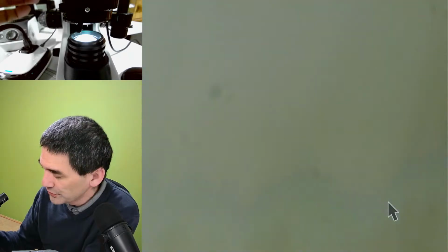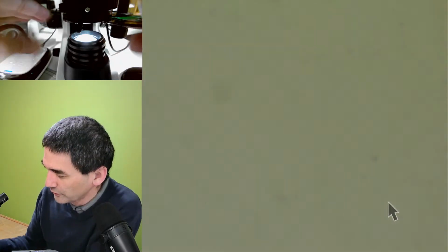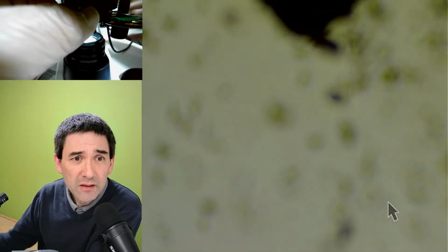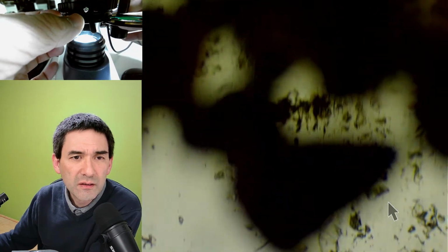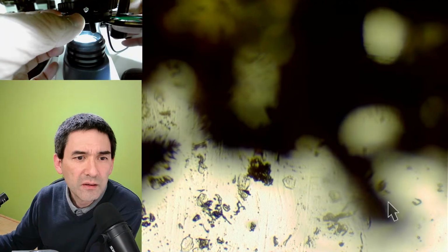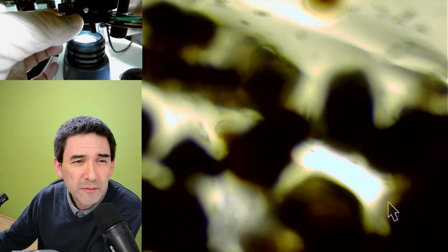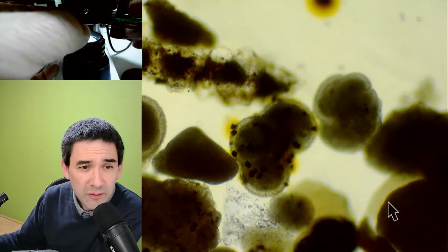So I'm going to put those in, but we might have to, yeah, I'm going to remove this here. We have to now really go down with the magnification again. I have to refocus. Yeah. And the question is, where are they? Yeah, the thing is that here, yeah.